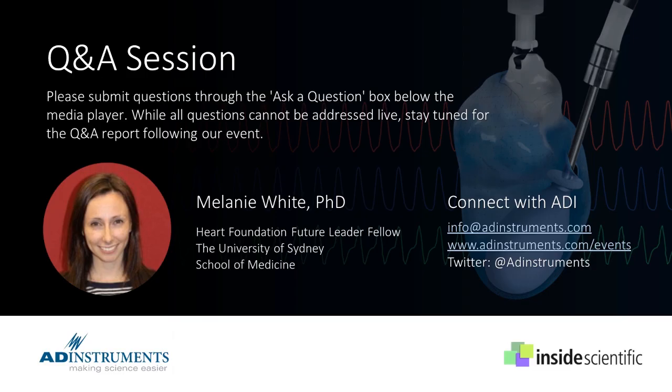Obviously, the advantage of this method of an experimental study is that the coronary vasculature is not going to be responding to additional factors like those humoral factors that could be released in an in vivo situation. But in this particular case, maybe something like a crystalloid perfusion setup would be ideal so that we don't have any of those humoral effects that may come from a whole blood perfusion system.